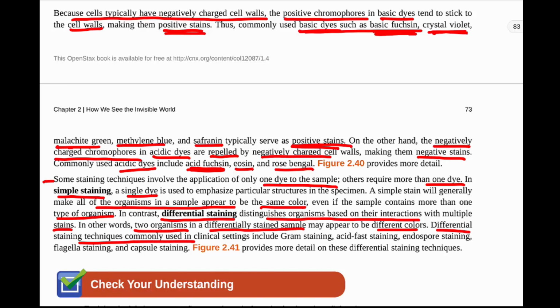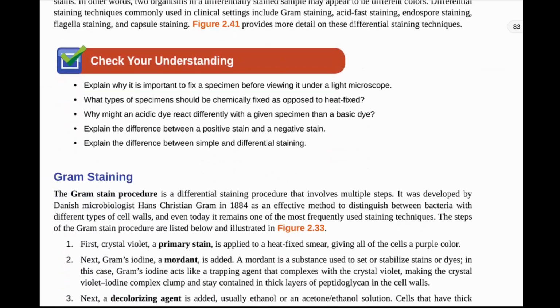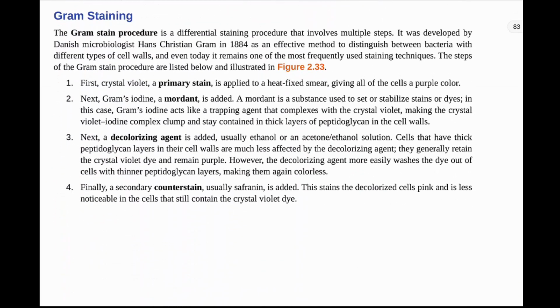Differential staining techniques commonly used include gram staining, acid-fast staining, endospore staining, flagella staining, and capsule staining. Again, you should know those things and know that they are a differential stain and not just a simple stain. And we're going to talk about those in more detail now. So first we have our gram stain.